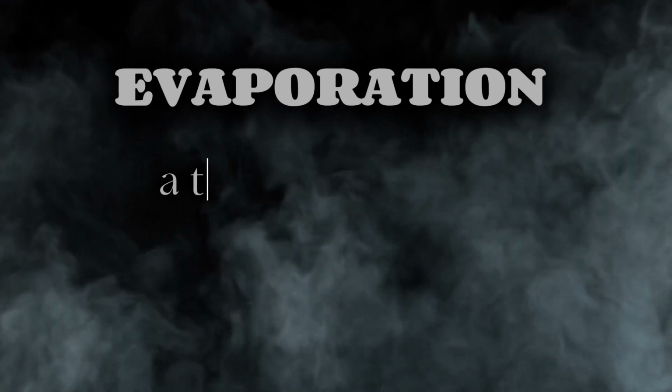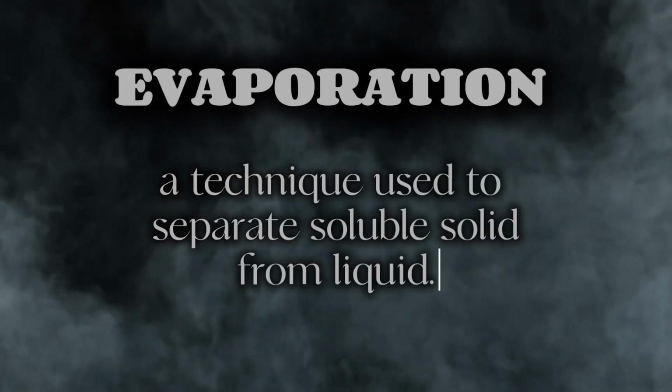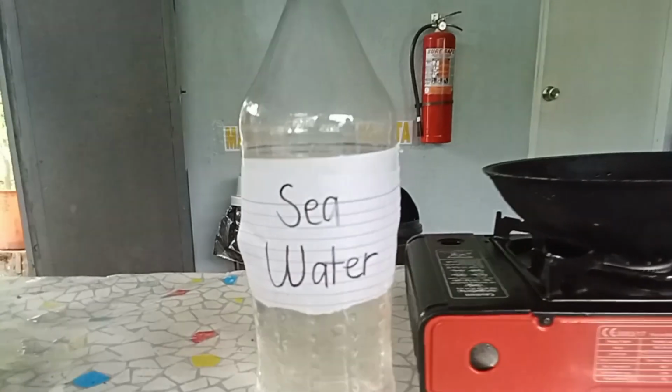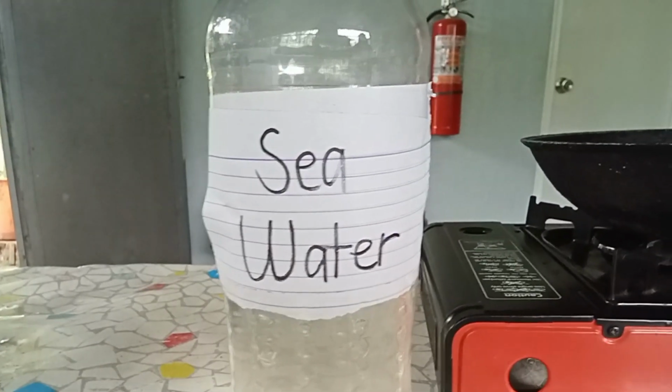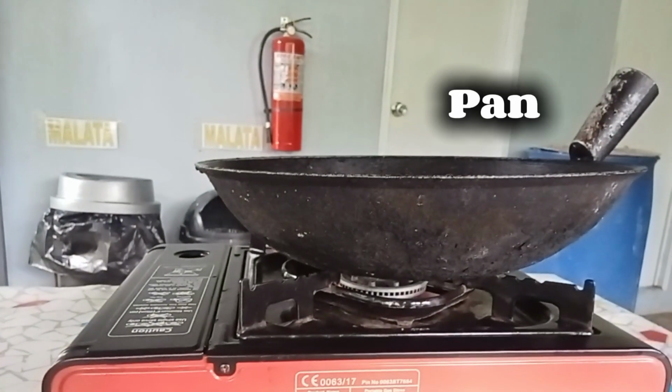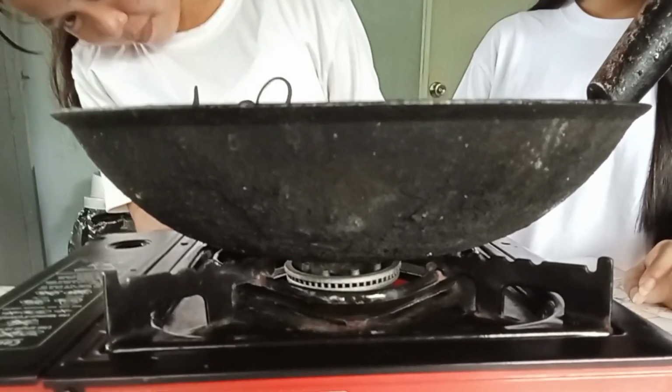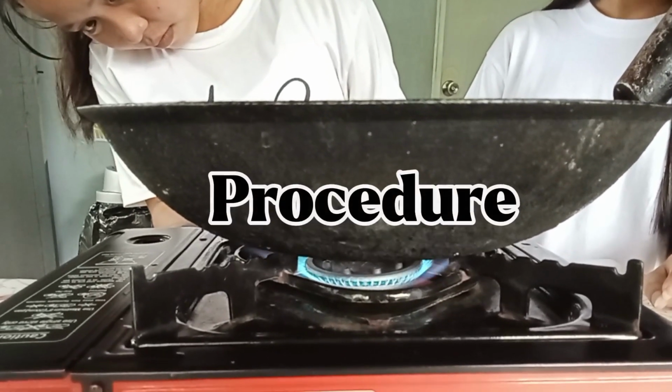Let's start with evaporation. Evaporation is a technique used to separate a soluble solid from a liquid. In our experiment, we will separate salt from seawater. Here are some materials that we can use in this experiment. Let's proceed to the procedure.